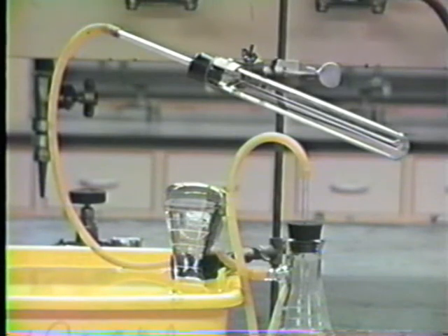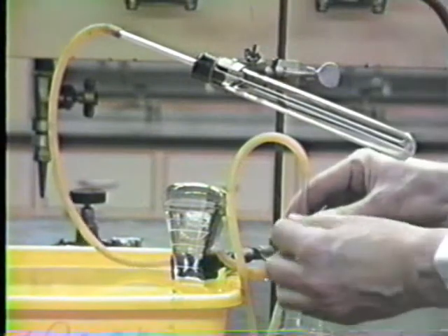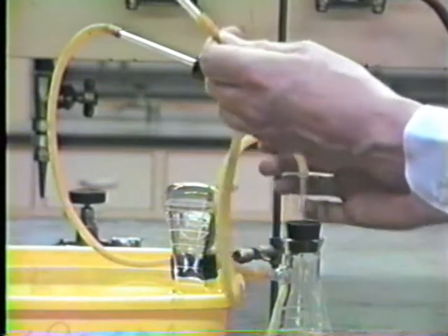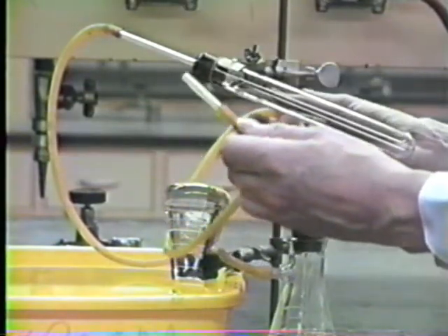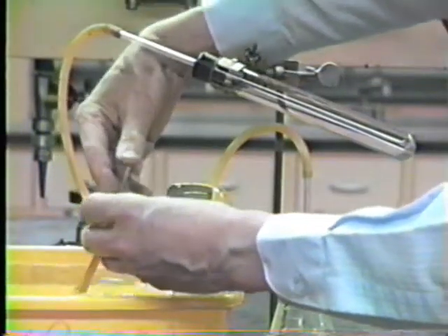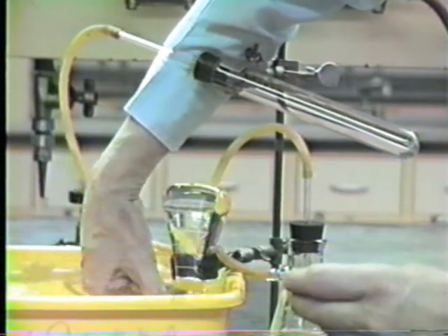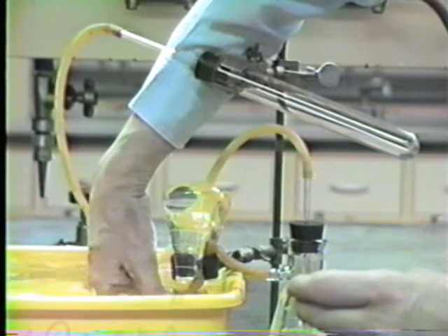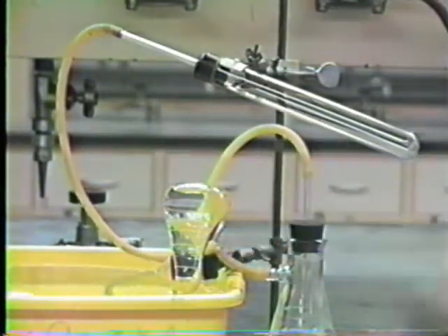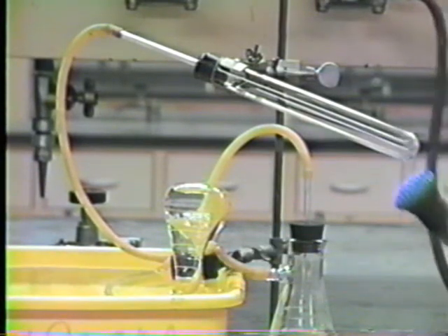All right, now we're all ready to run this reaction. First thing, double check to make sure that all of these connections here are tight. Then you take the outlet from this surge bottle here and put your finger over the top here so that you don't get any water in there, and then slip it underneath into the flask here. There'll be some air which came out, but that water which went into the tube will be blown out when we heat this up.